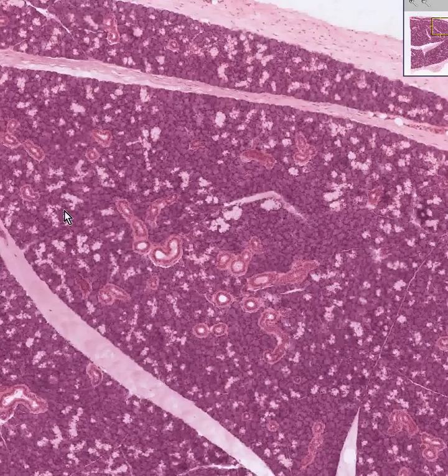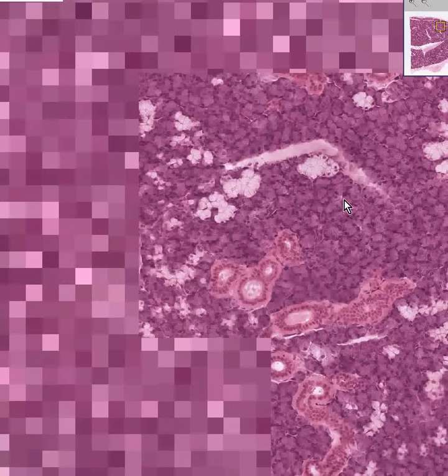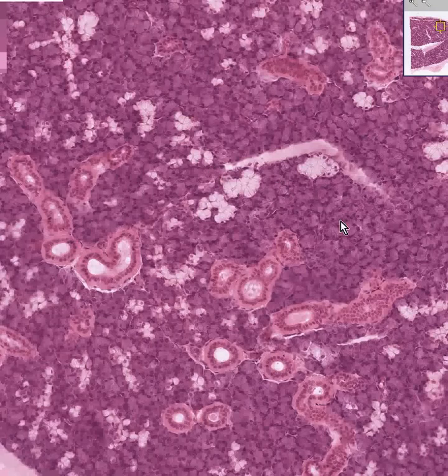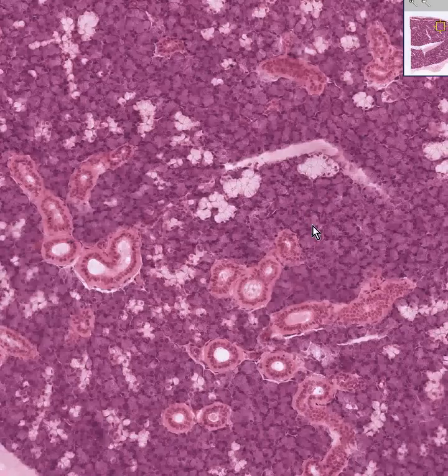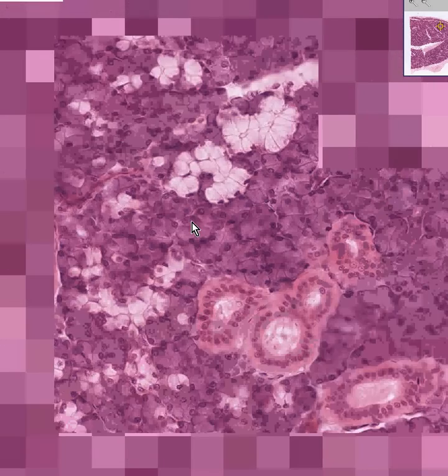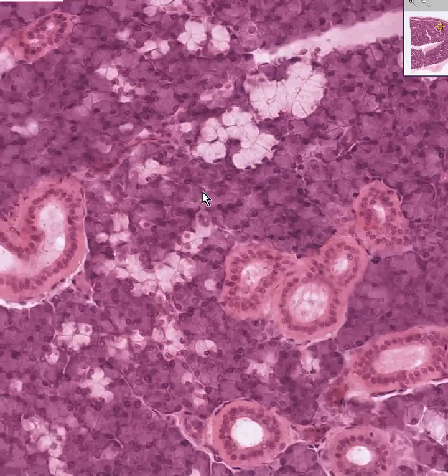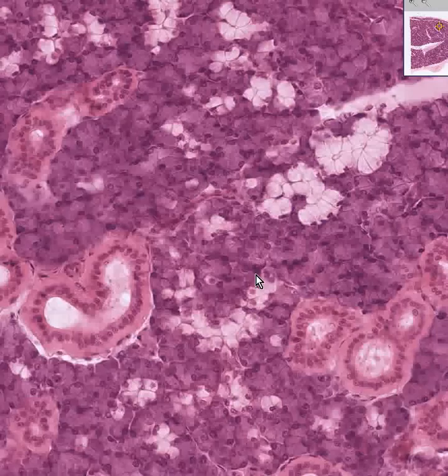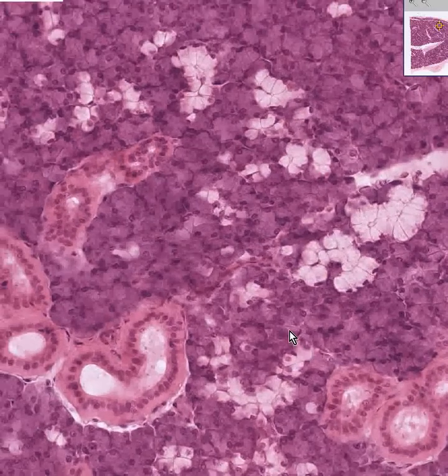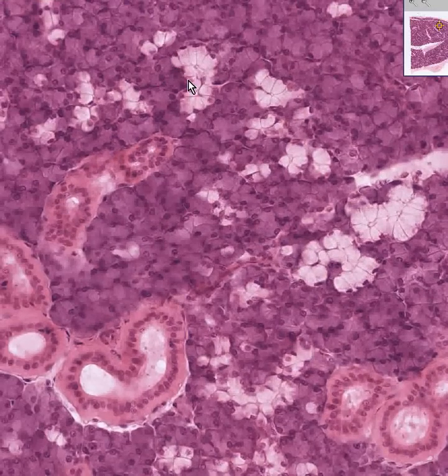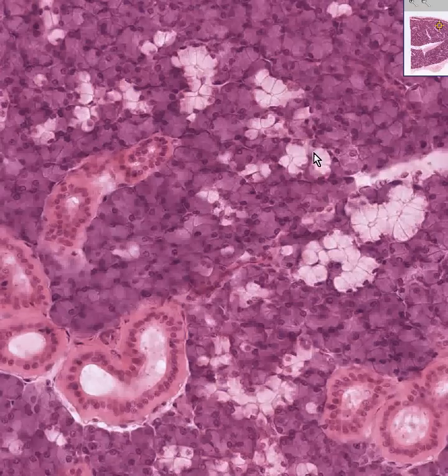Within the lobules you have a lot of intralobular ducts, almost all of which are striated. Also in the lobule you have the acini. In many areas the acini are 100% serous, but in some areas they are mucinous. Sometimes you'll get an acinus that's half serous and half mucinous, and if that is the case, you would call the serous portion a demilune, because frequently it looks like a little moon being displaced by these clearer, more mucinous cells.